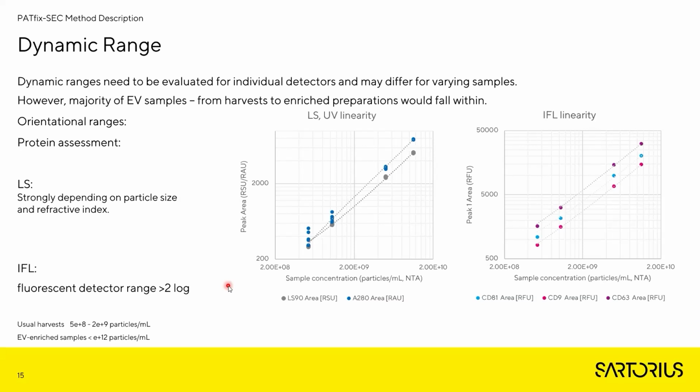However, based on our experience, the usual EV samples normally fall within the range of the described detectors.